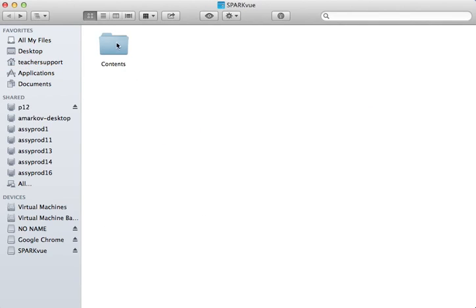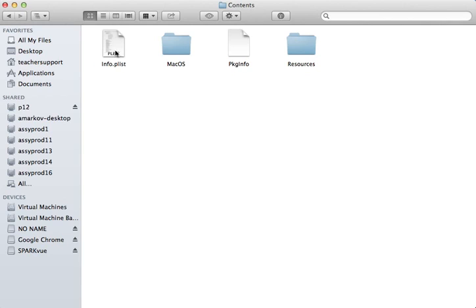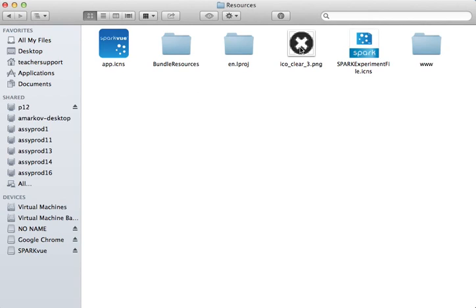I'm now going to open the Contents folder, open the Resources folder, and then finally open the Bundle Resources.